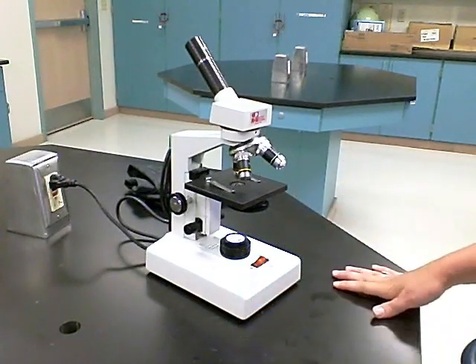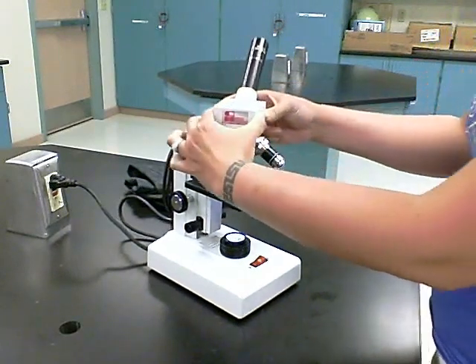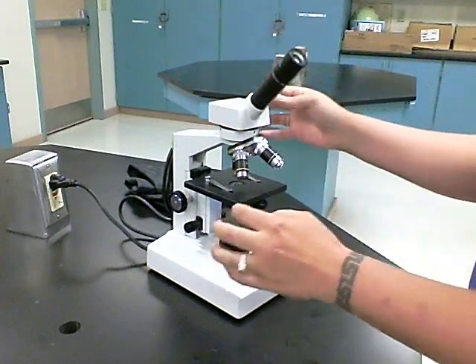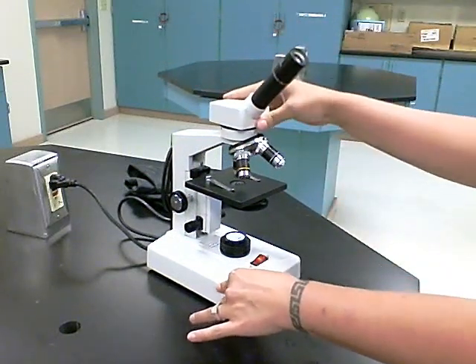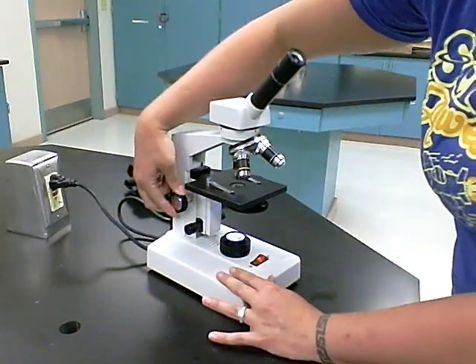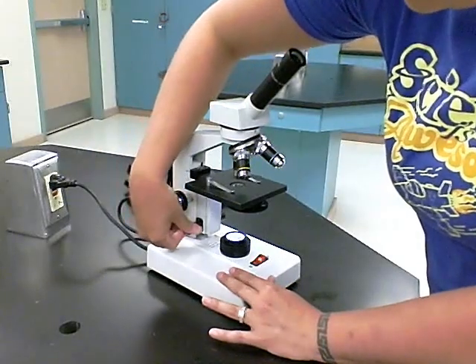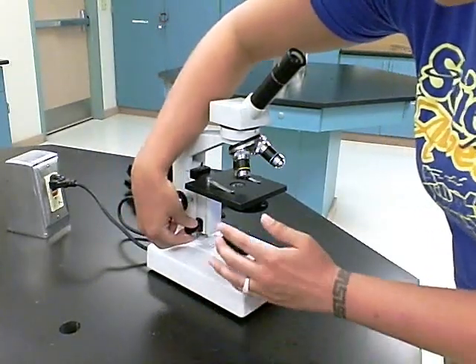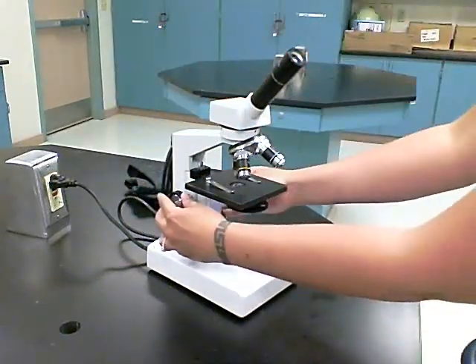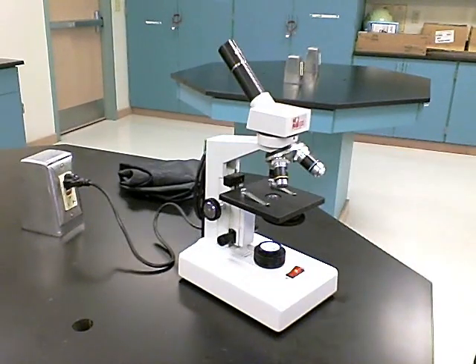Okay, whenever you're ready to bring a slide into view, the first thing you want to do is rotate this ocular lens around so that you can have it in front of you instead of having to view it from behind. There are two focus knobs here. You have the coarse focus, which raises and lowers the stage. And you have this smaller knob, which is your fine focus, which you'll notice does not raise or lower the stage. It just finely focuses in and out. And you have these knobs on both sides, so you can do it with one hand or with both hands.